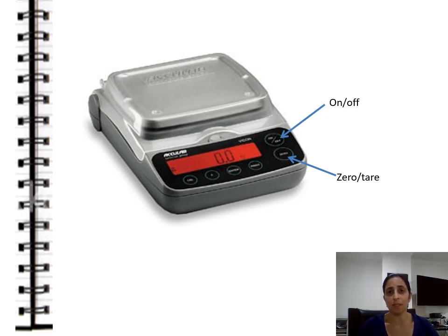Otherwise, if you don't press the tare button, you weigh your container first and then you put the powder in there, and then you subtract the mass of the container from the mass of the powder plus the container. And a lot of the balances have this little balance symbol that tells you when the balance is stabilized so that you can record the mass that's on the display.